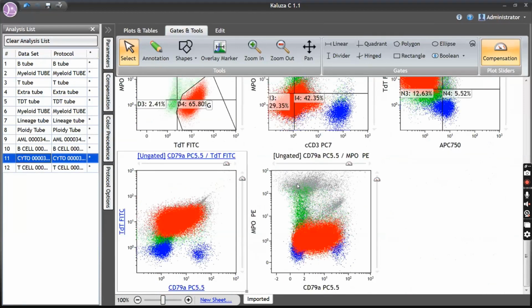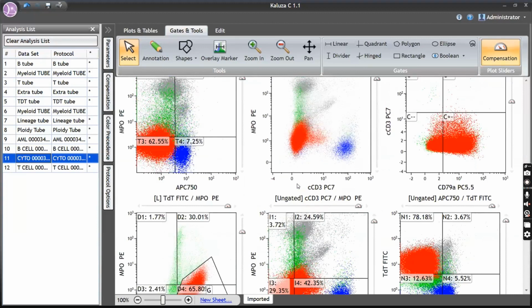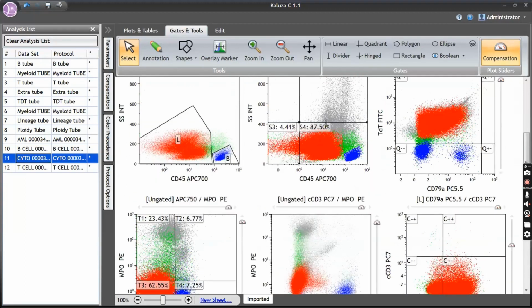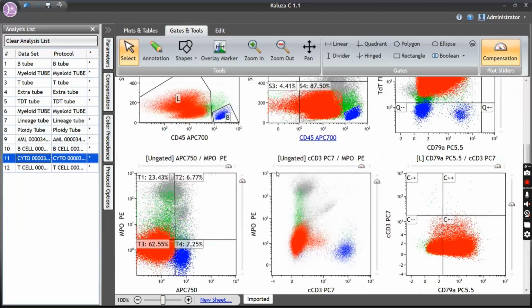Yes. Only doubt was CD13, CD33, CD117. These 3 were positive. Yeah, could be, it can come. Because MPO is negative, you can't sign it out as MPAL. Beyond that, it's fine. That CD4 is something which I feel I need to look into. I have not seen much of B-ALL with CD4 positivity. That is something very new.